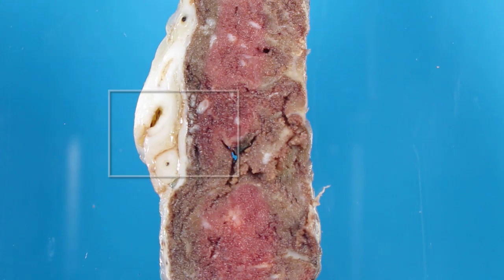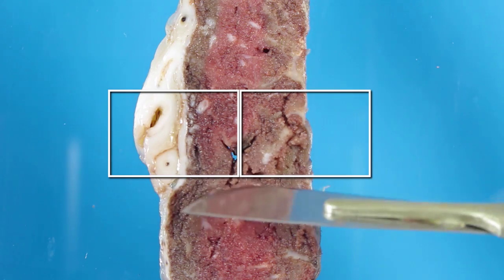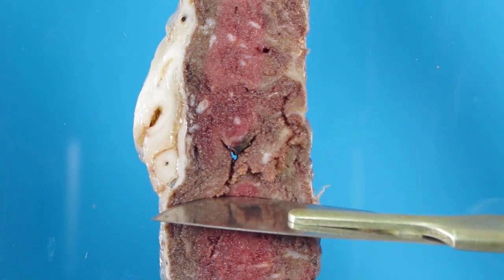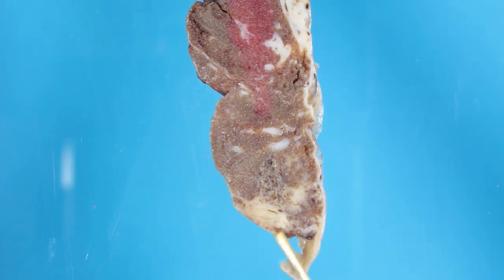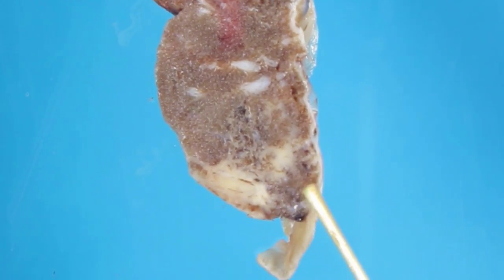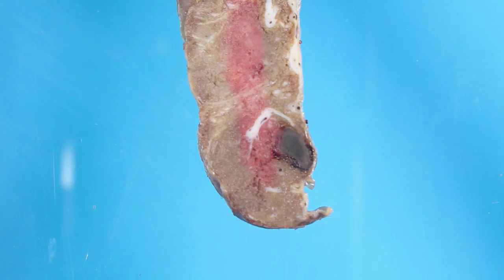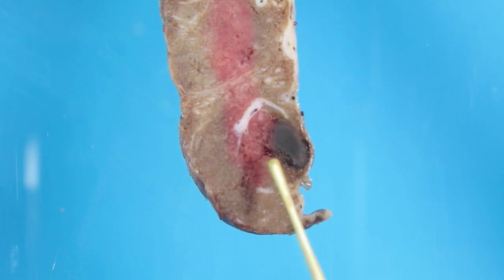You need to take a section through the cord insertion site — so you take a section around that site, complete thickness unless it's very thick, in which case you may take it in two different portions. This is a small peripheral infarct here, or it could be that there is some fibrin deposition as well. This is a term placenta, so there is probably not a huge clinical significance associated with peripheral small infarcts such as this. This is a small subchorionic hemorrhage here, and the site and size should be measured.